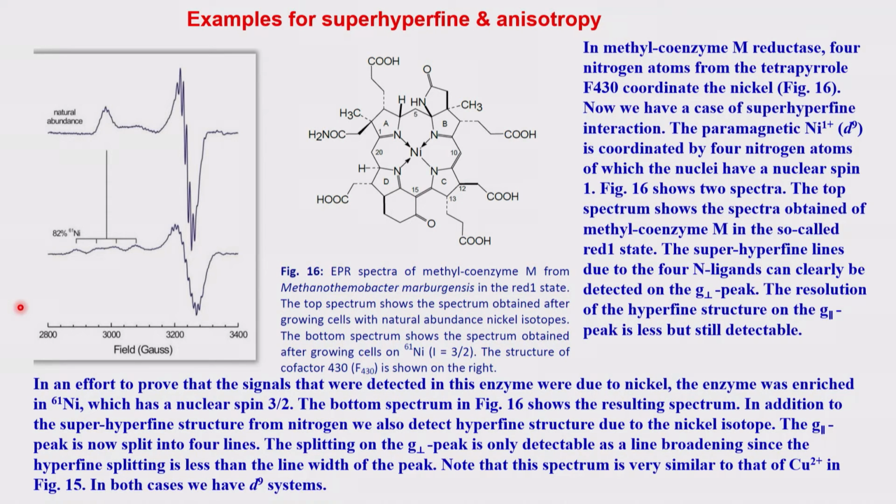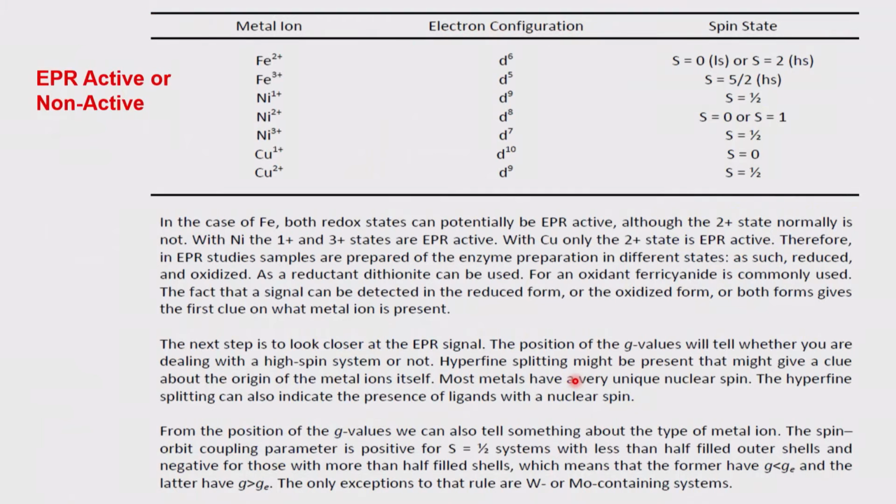So it's a very characteristic spectra, nothing else can happen, and therefore anything can be easily understood by looking at the spectra. Now you can see the signature patterns which I have been talking about in the past, 2 classes, the hyperfine and super hyperfine further splitting. I explained to you all of this using examples. Now you don't need to read all of this.